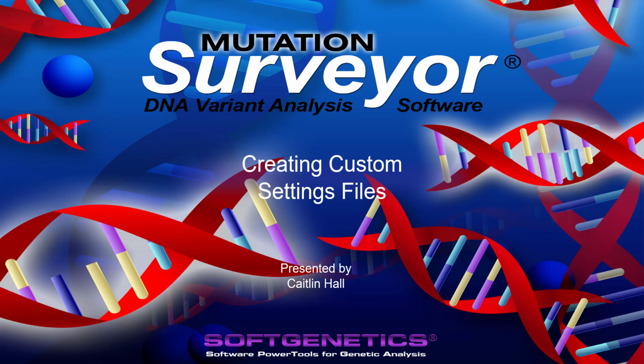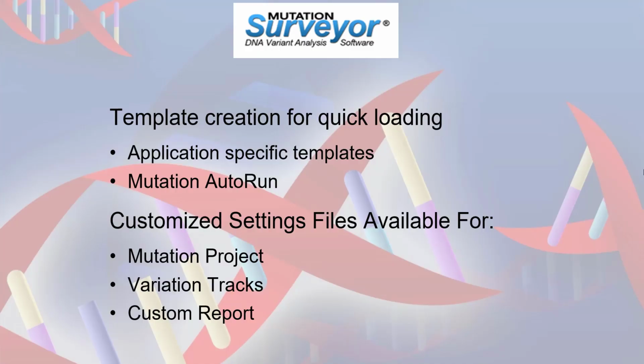The focus of this webinar is how to make and use custom settings files in the software. The creation of custom settings files allows for the establishment of templates that can be quickly loaded without the need for manual adjustment of the settings. A configuration file can be created for each type of analysis and can help ensure consistency when shared between users.